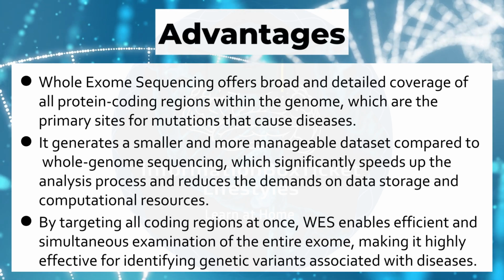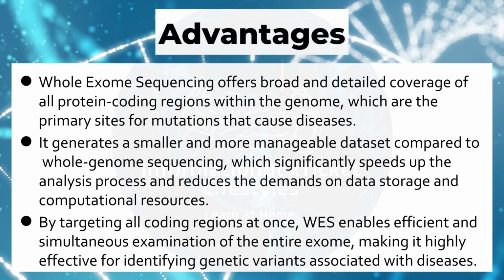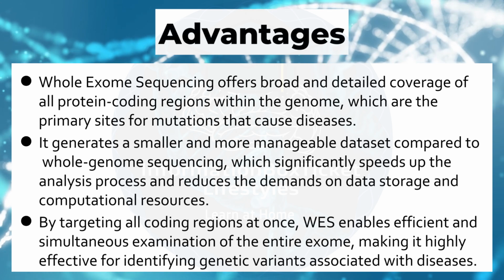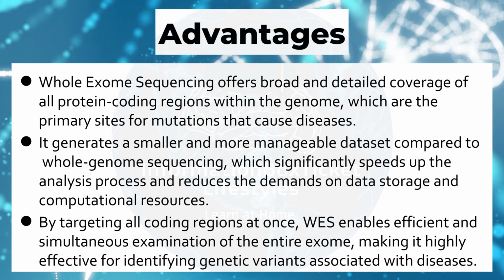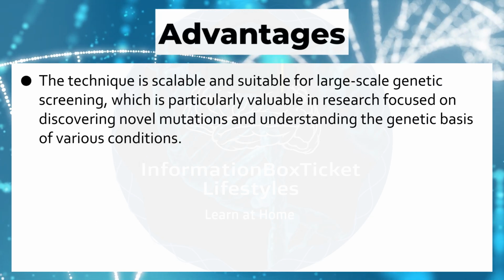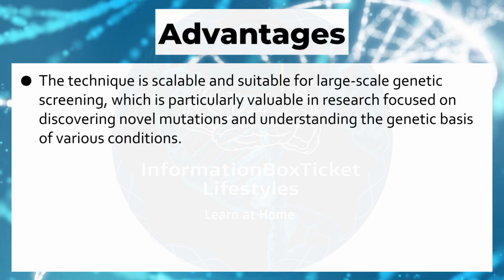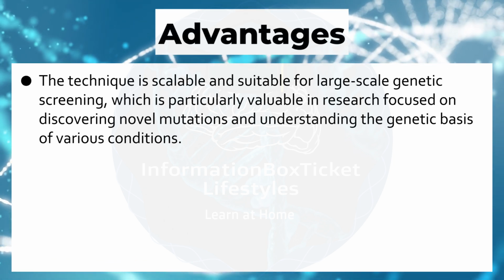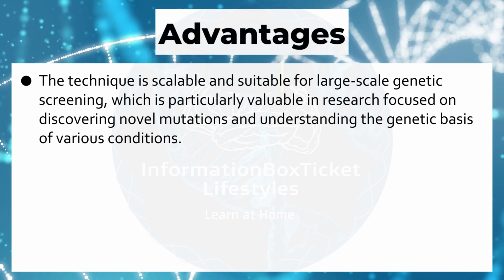By targeting all coding regions at once, whole exome sequencing enables efficient and simultaneous examination of the entire exome, making it highly effective for identifying genetic variants associated with diseases. The technique is scalable and suitable for large-scale genetic screening, which is particularly valuable in research focused on discovering novel mutations and understanding the genetic basis of various conditions.